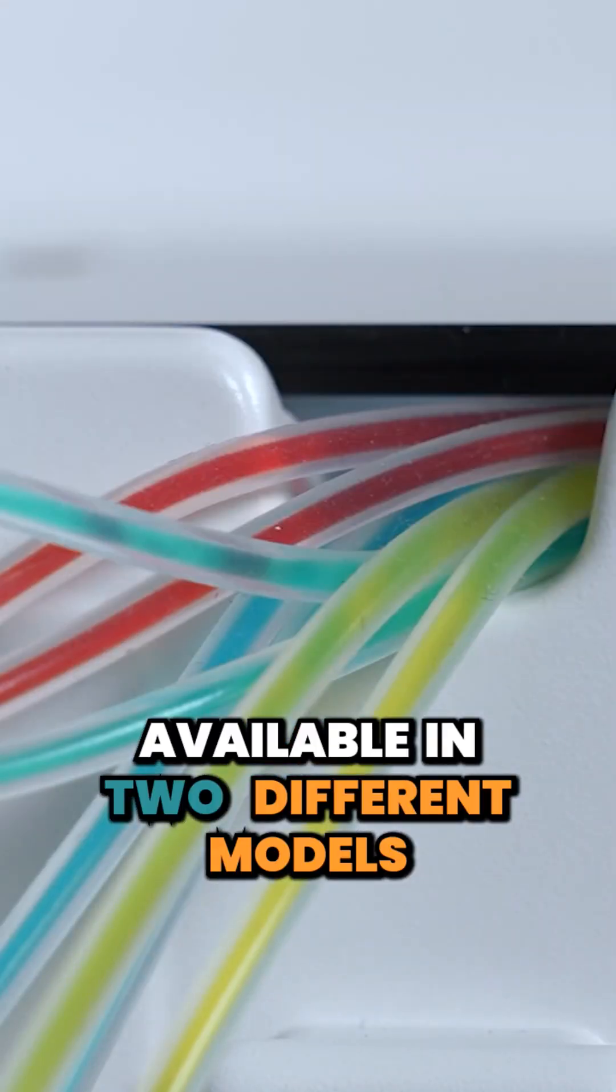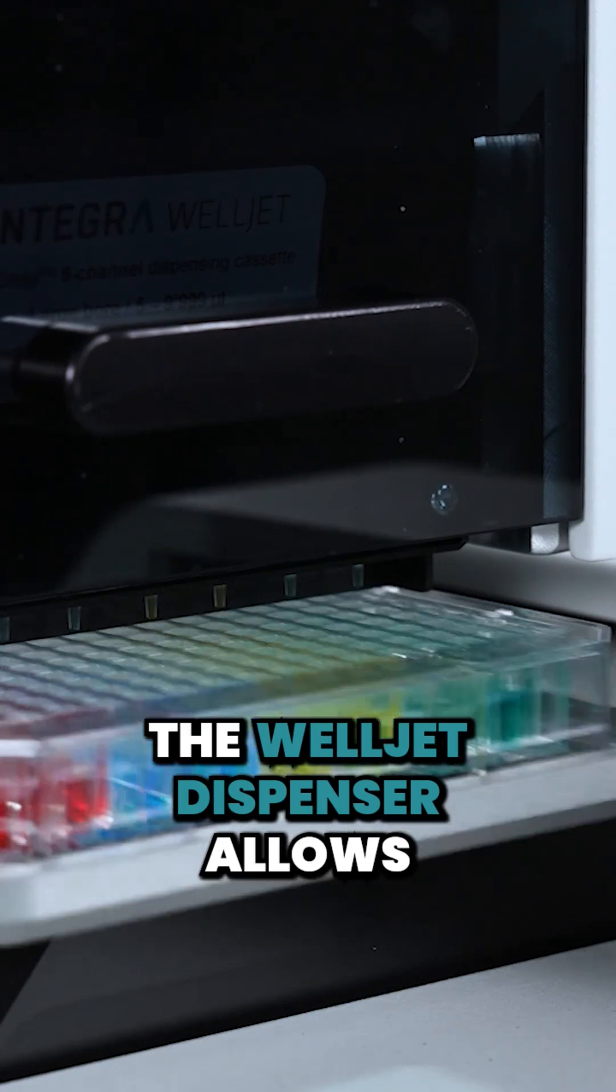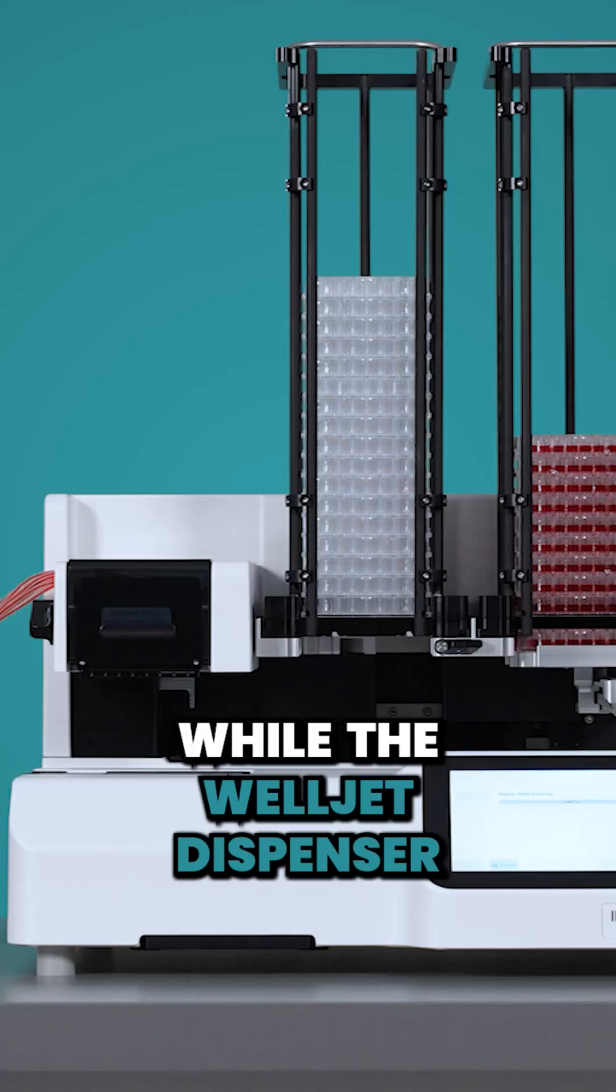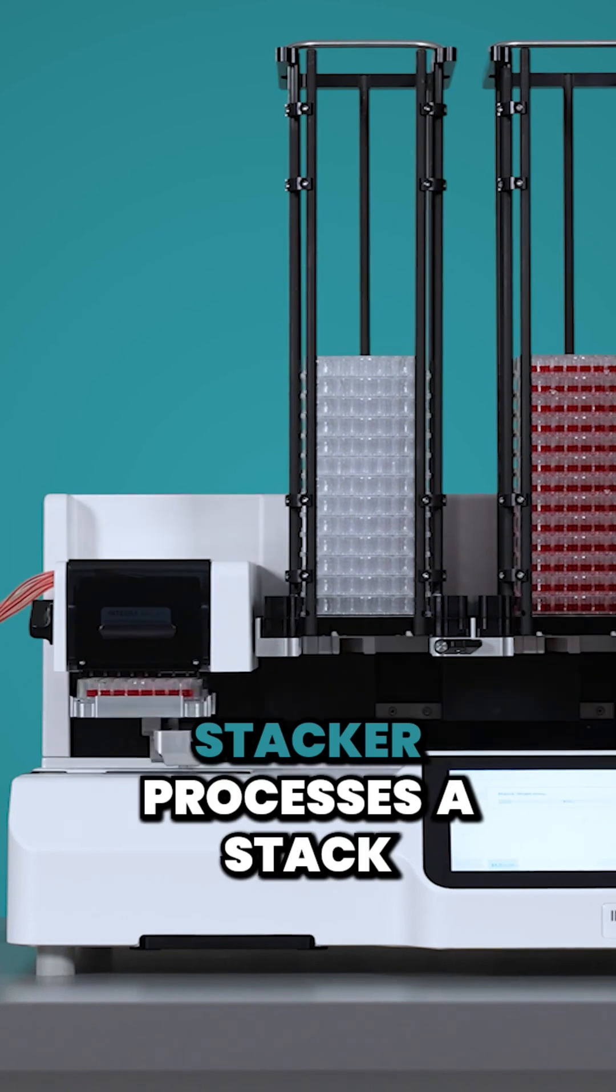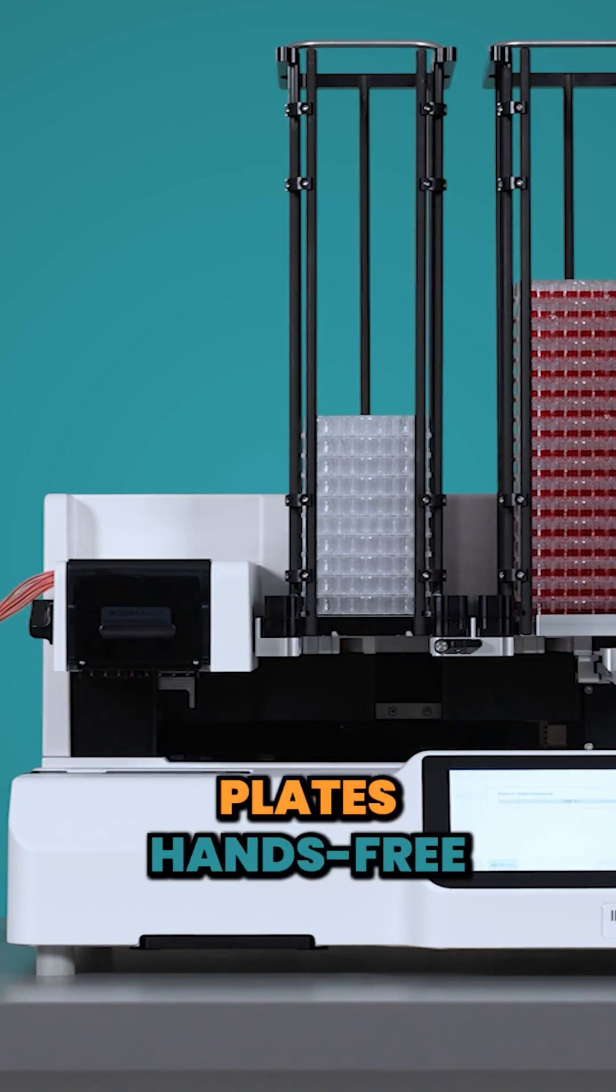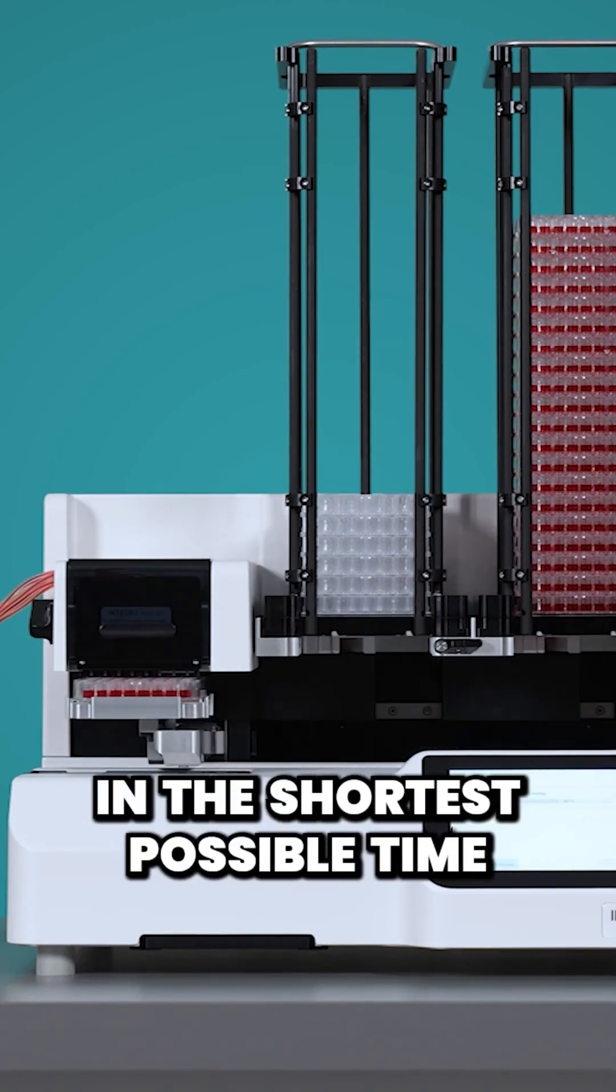Available in two different models, the WellJet Dispenser allows individual microplates to be filled quickly, while the WellJet Dispenser stacker processes a stack of up to 50 plates hands-free in the shortest possible time.